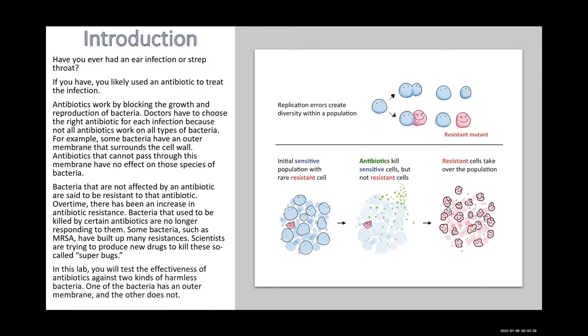In this lab, you will test the effectiveness of antibiotics against two kinds of harmless bacteria. One of the bacteria has an outer membrane and the other does not.